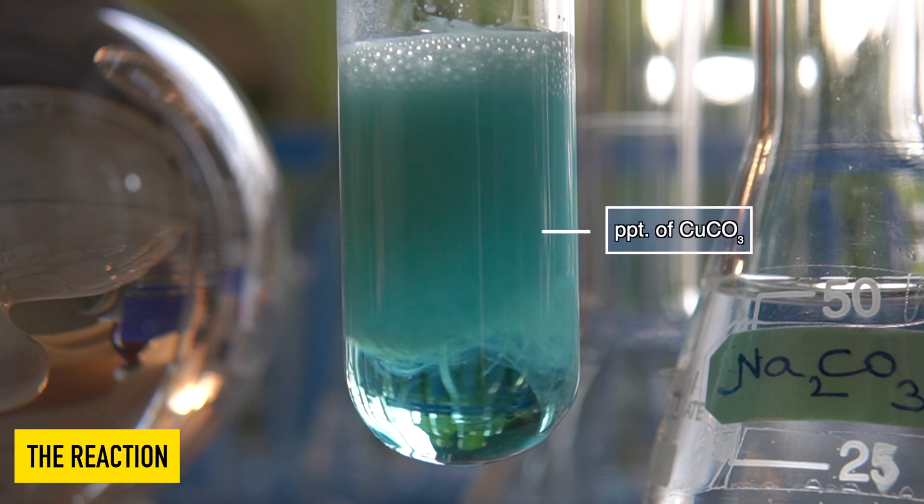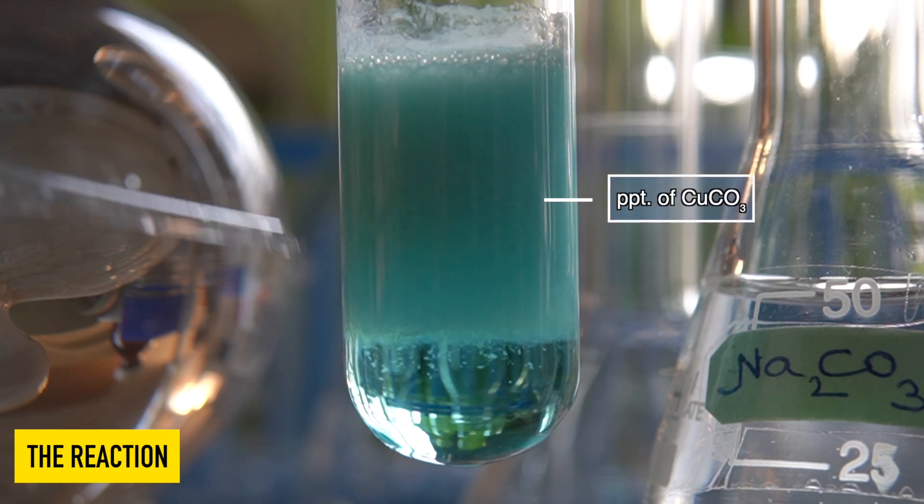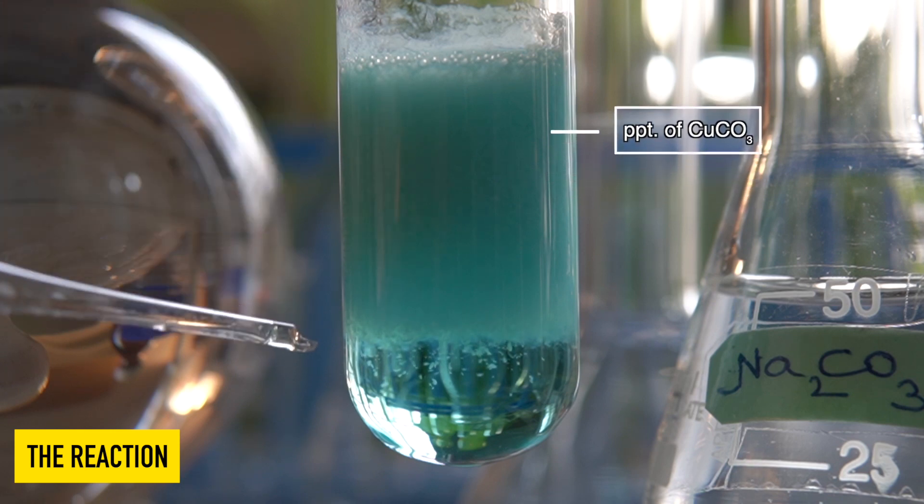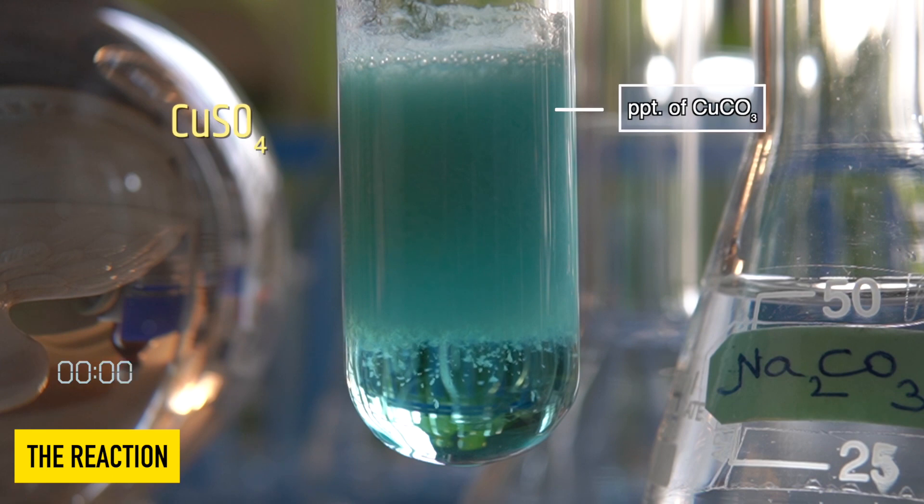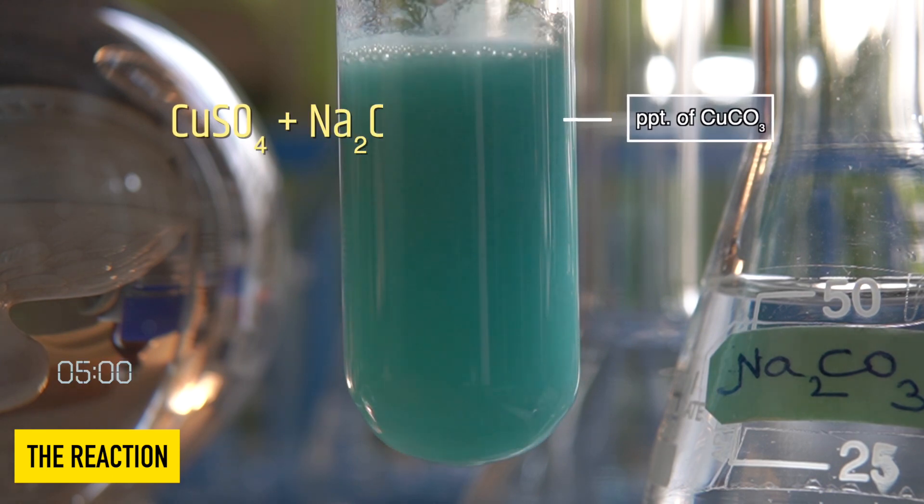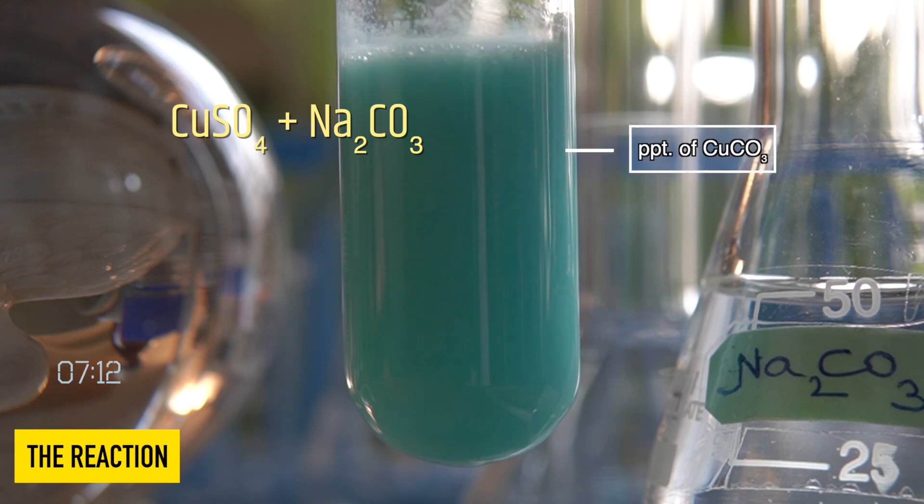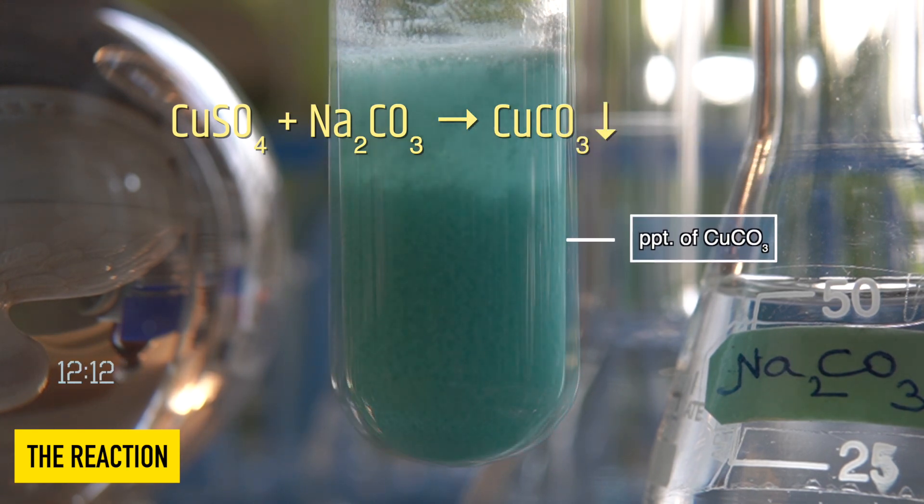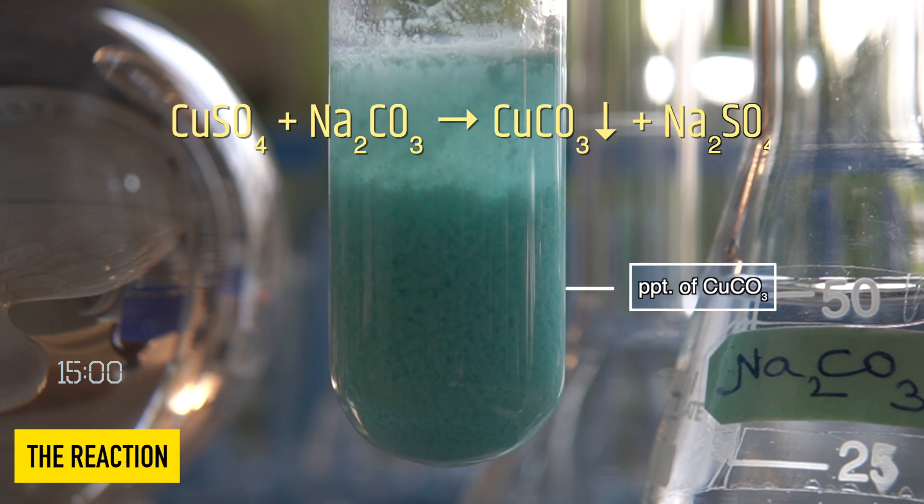The blue insoluble precipitate that has been formed inside the test tube is nothing but copper carbonate. In this reaction, copper sulfate reacts with aqueous solution of sodium carbonate to produce a blue precipitate of copper carbonate along with sodium sulfate.